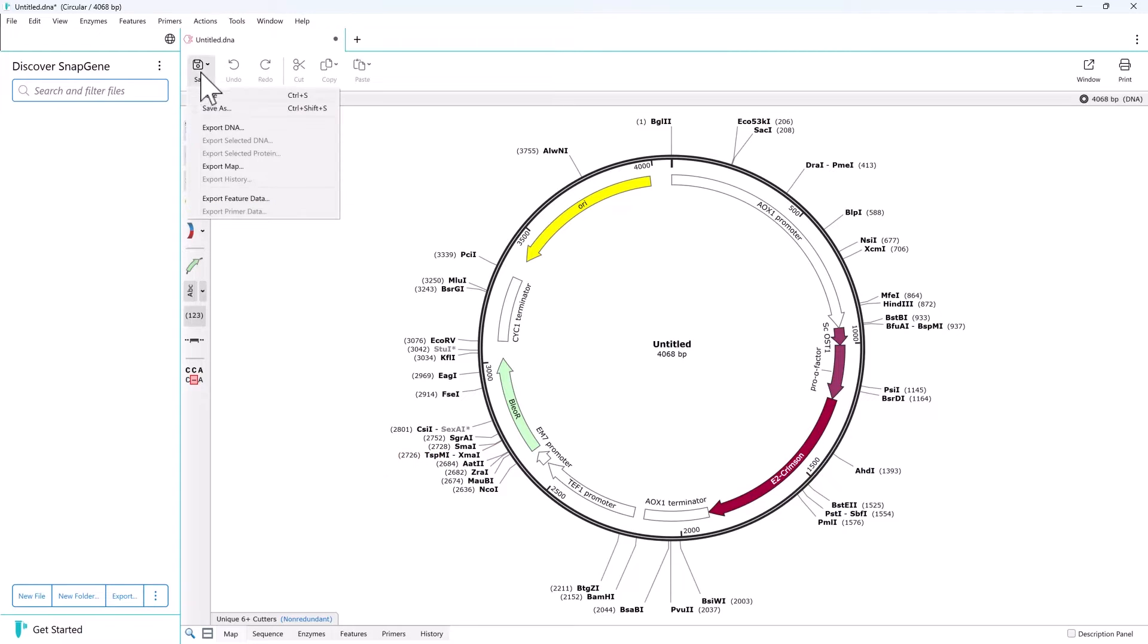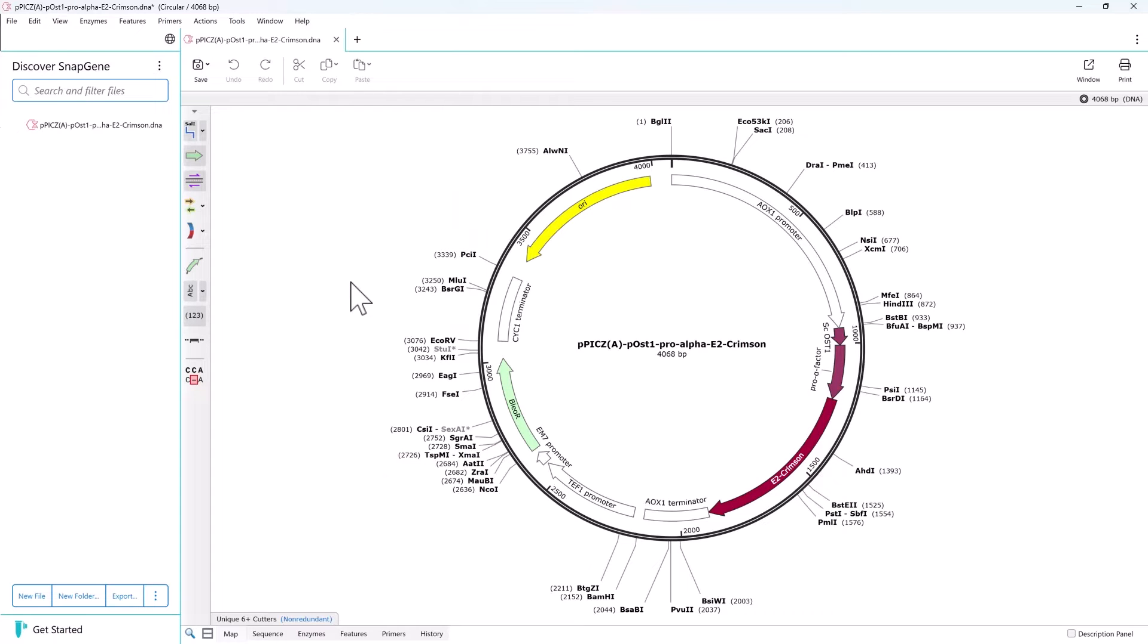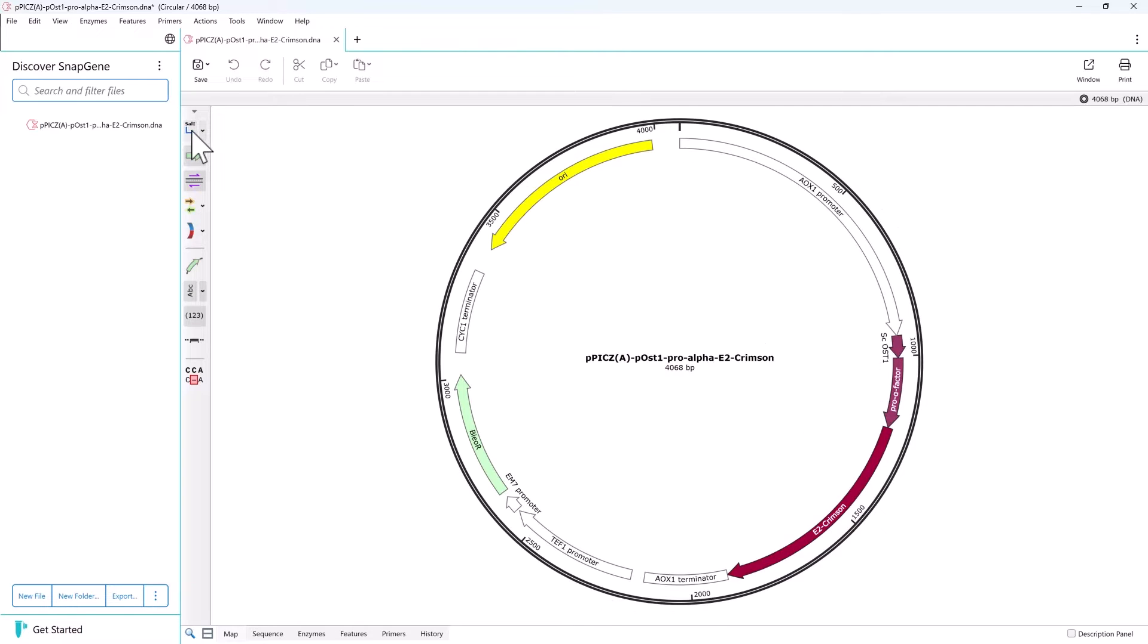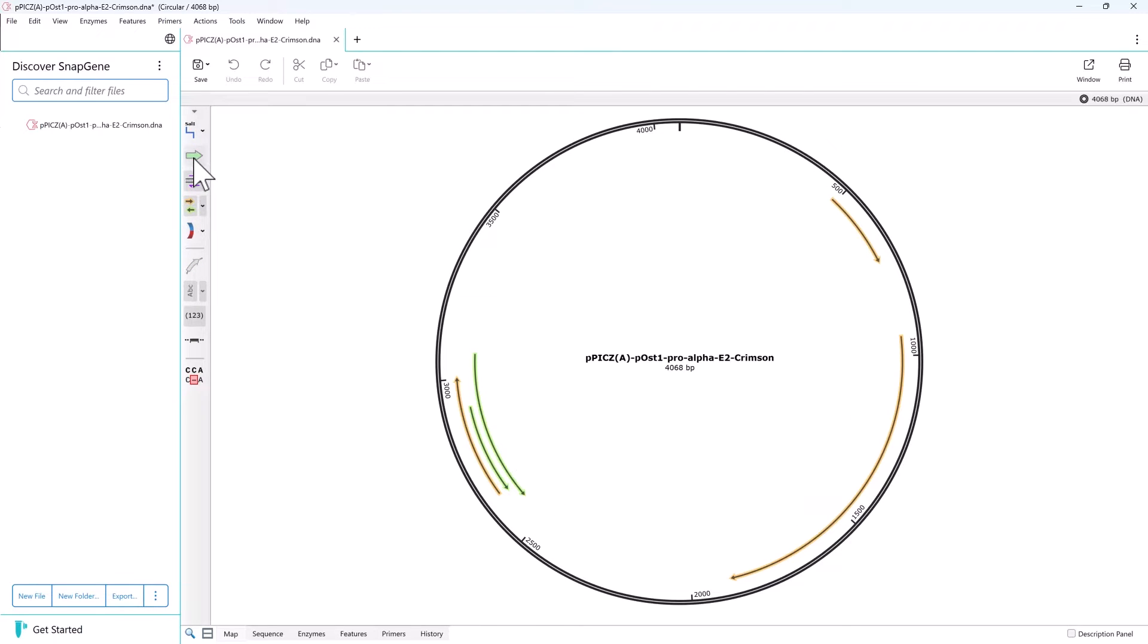Save the new sequence to your project folder. This map view can be changed using the left toolbar. For example, we can show or hide restriction enzyme sites, find predicted open reading frames, and change how features are displayed.